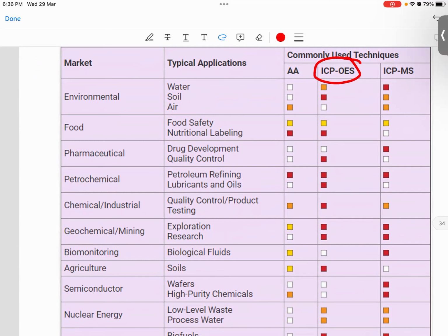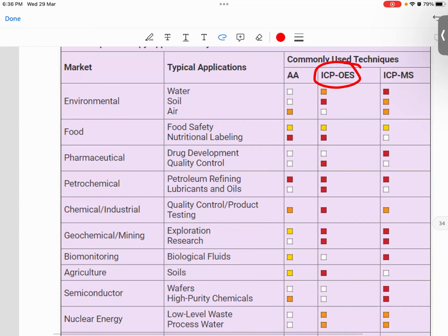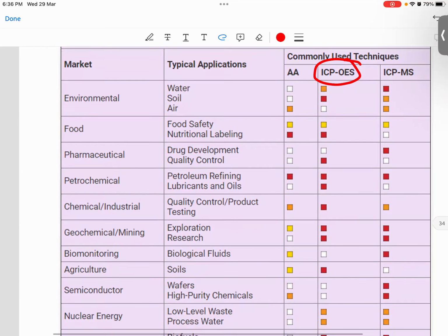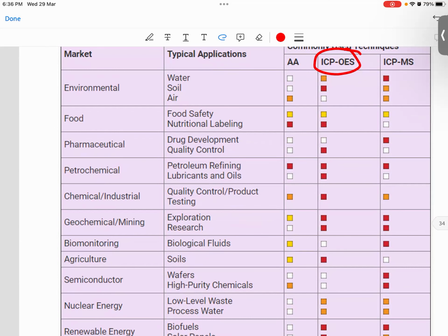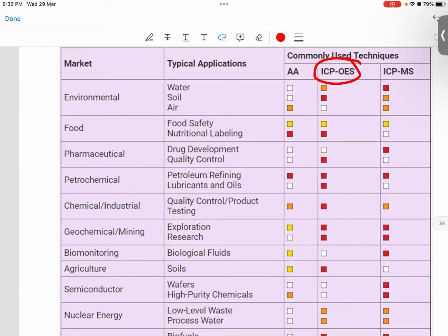Hamima, I'm sure that she knows. It's optical, right? Yeah, optical. Optical emission spectroscopy. So what's the biggest difference when we say optical? The word O instead of A. I think, yeah, it's the same instrument. But using optical? I'm not sure.